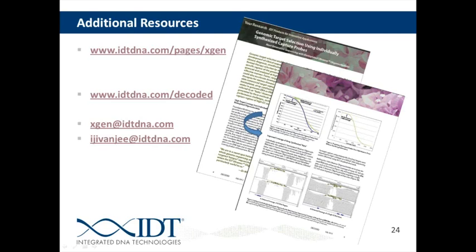Here's a pretty straightforward question. Does IDT have any software for designing the panels? Ibrahim? Adam? The short answer is no. We don't at this point in time.